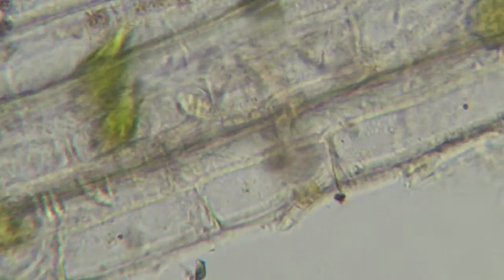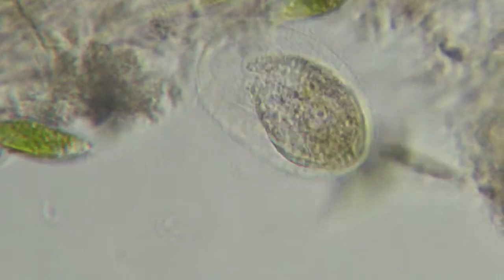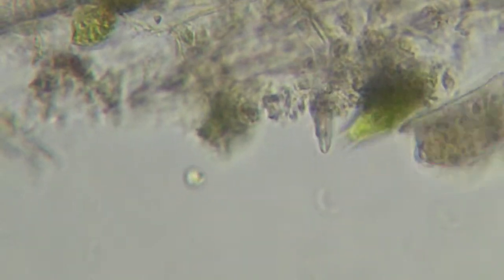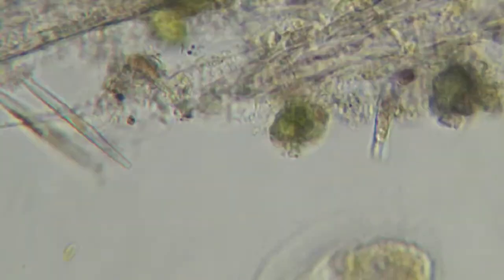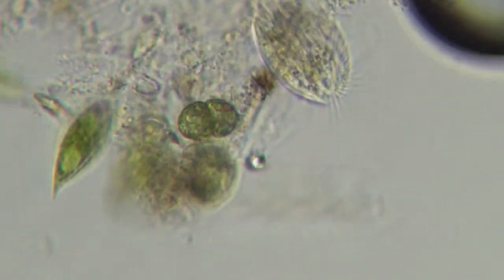Yeah, this debris is great. This is like a mini forest almost. You find all kinds of stuff congregating around these debris piles. There's the one that's flexible. See that lip pushes up on the edge of stuff and goes up. They're so bizarre. They move so differently compared to these other ciliates in the area. There's another. Oh, there's a Euplotes right there.